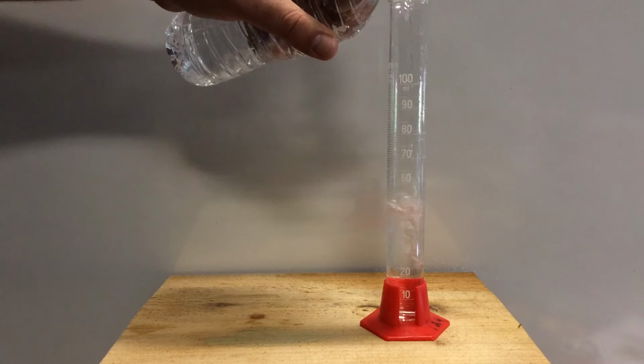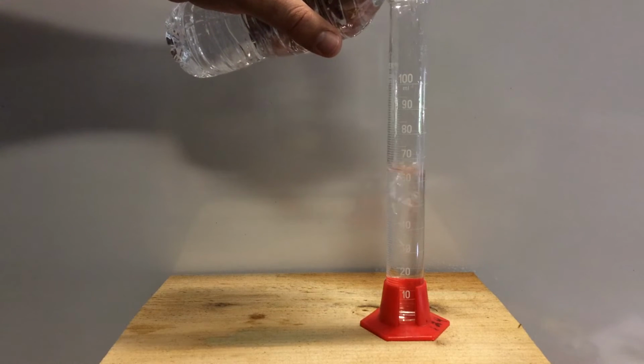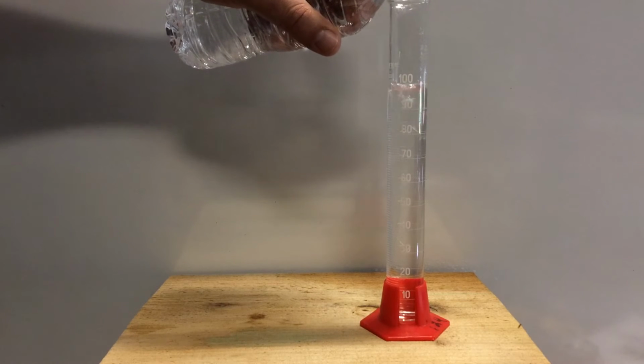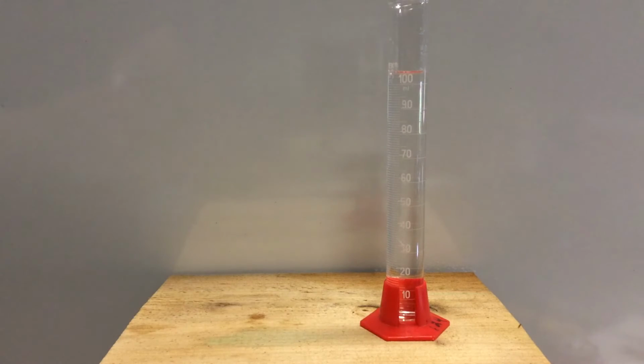Now you notice the graduated cylinder has markings on it, calibrations, and those calibrations are something that I'm going to read and make sure we understand how much. Now we're going to have to get up close and personal here to see exactly what my value is. I'm trying to get 100 right on the 100 mark.